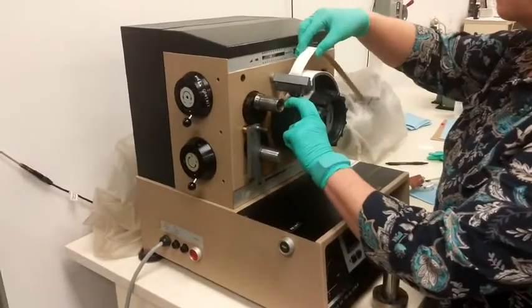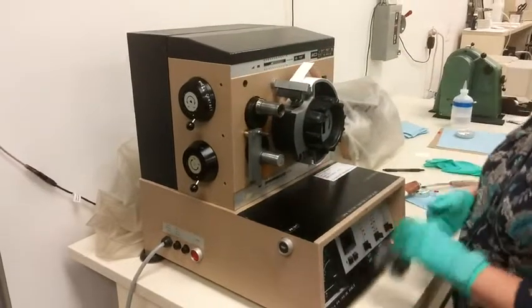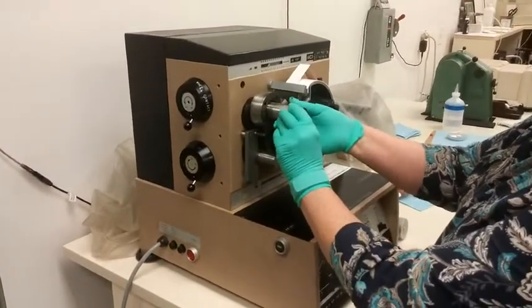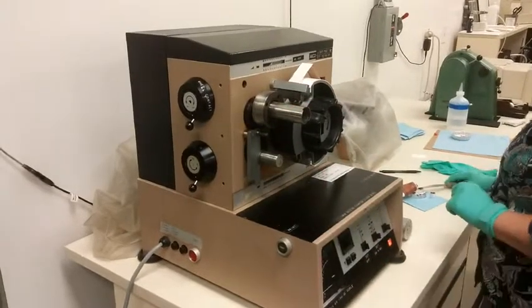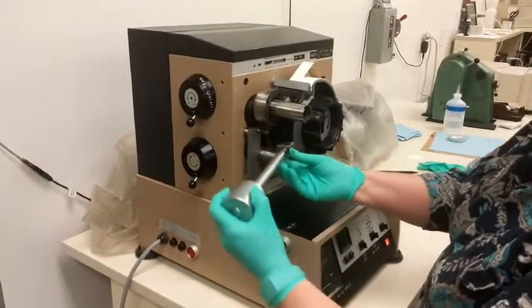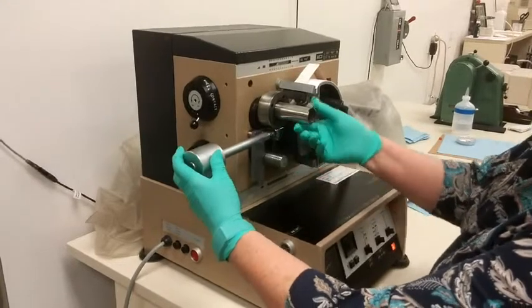The IGT pick and blister test measures the ability of coated or uncoated paper or paperboard to resist picking or blistering during offset printing. When operated with a Westphaco rod applicator, a 15 micron film thickness of polybutine oil of a given viscosity is metered onto the surface of a steel roll.